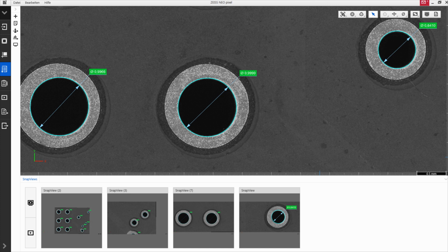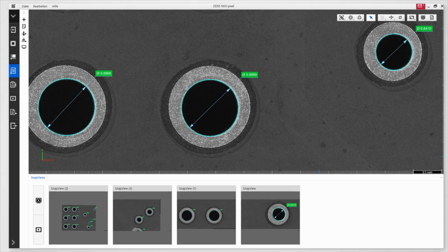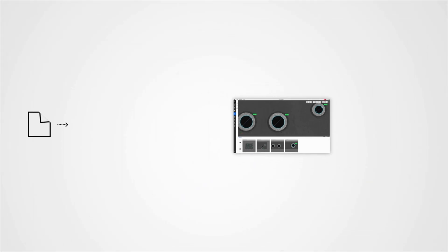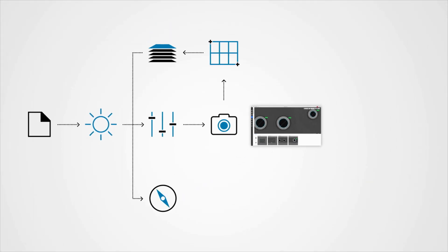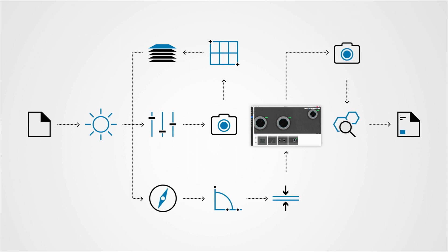dimensional measurements—the respective tools are just one click away. They can be used for free examinations or as part of predefined automated jobs. Every workflow can be optimized according to your specific tasks.